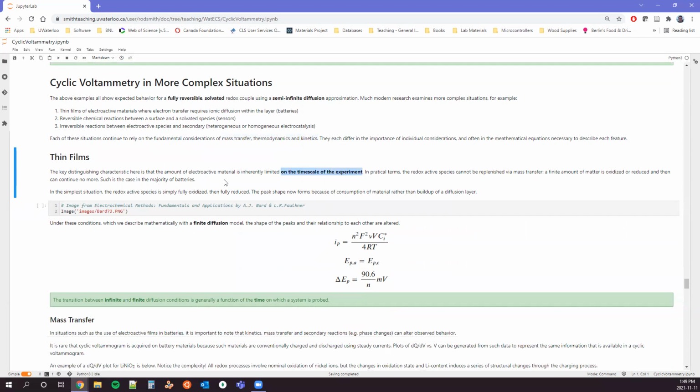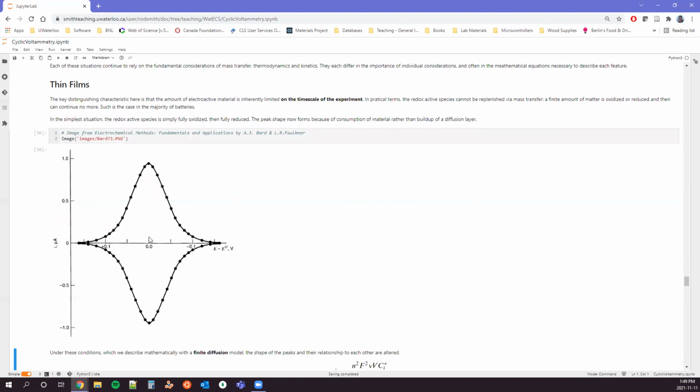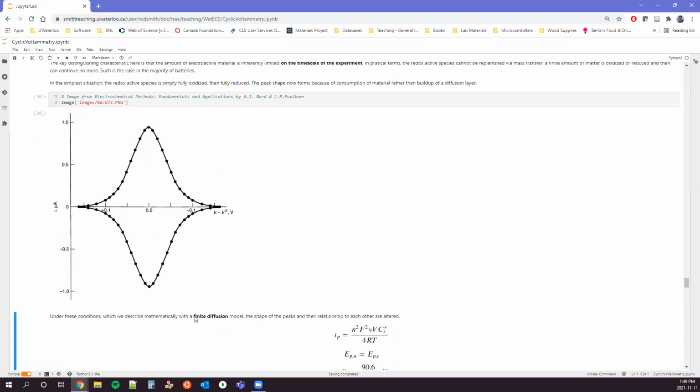And so we're now working in a restricted amount of material, but also one of the most important things is that it's going to have a change in diffusion, basically. And so what we can look at is if we were to have an immobilized monolayer, right? If all that we're looking at is thermodynamics, what we expect to see, and you can find this in Allen Bard's textbook, is peaks that are directly on top of each other. And so we're seeing the Nernst equation, and here we've passed the inflection point in the Nernst equation, and we're coming back down because we've changed all of the material on the surface. We cannot replenish it from bulk solution.